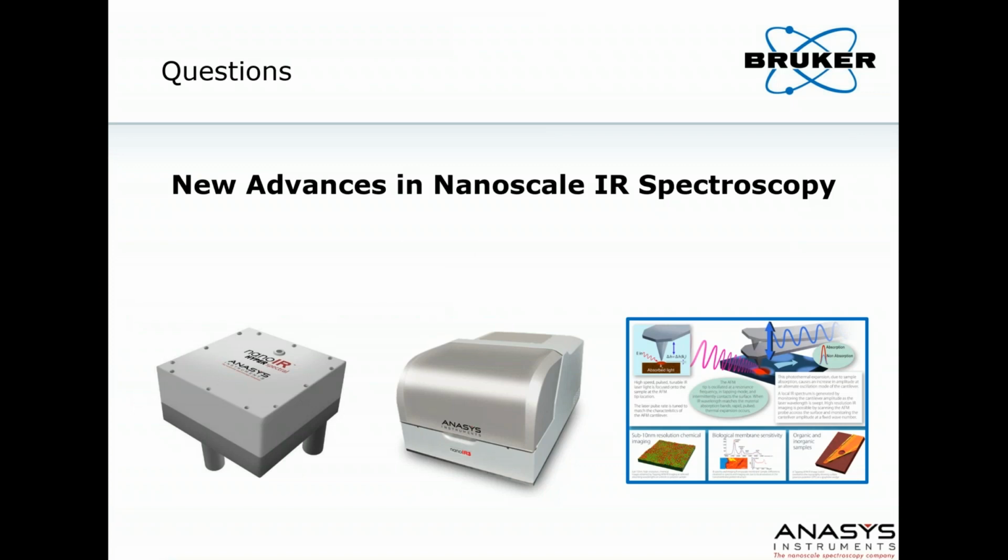Well, the first question was, for fluid AFM-IR, does Bruker Anasys have a component to allow for fluid experiments? So a lot of the fluid work, maybe Curt, you can just explain briefly, because I think the other question was related to how do they do fluid measurements in AFM-IR, and wouldn't that impact the signal? Maybe if you just briefly explain the principle they used, that Simone and Andrea used. Okay, first of all, you have to go back to the first generation instrument, the Nano IR1. No one's doing fluid on a top-down.